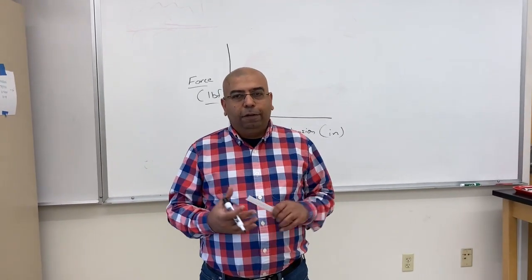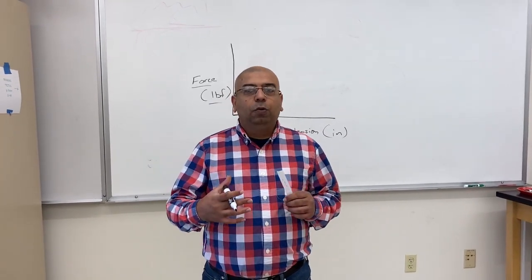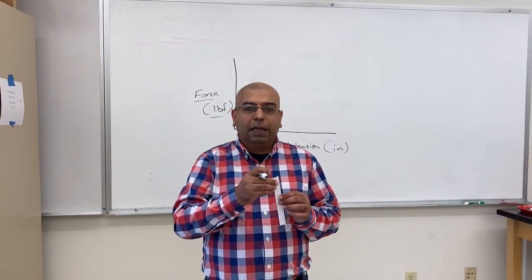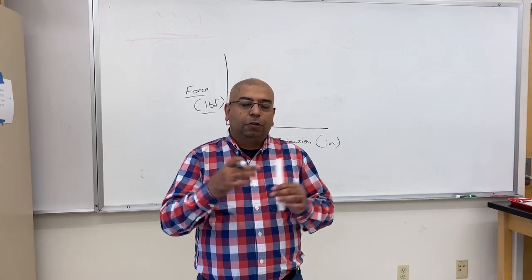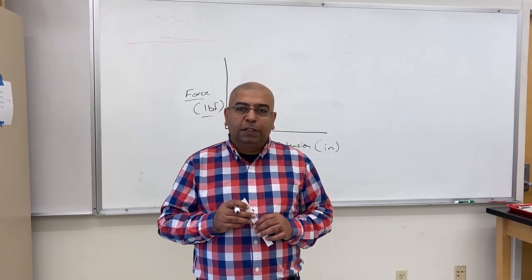So the force could differ with the thickness of the sample. So we have to adjust, keeping in mind the width or the thickness of the sample. If I do not use 1 inch, instead of 1 inch I have 1.5 inches or half an inch, so the force can change.